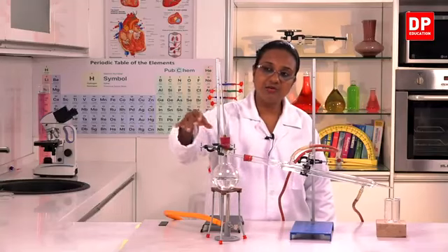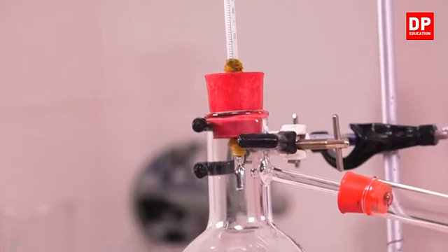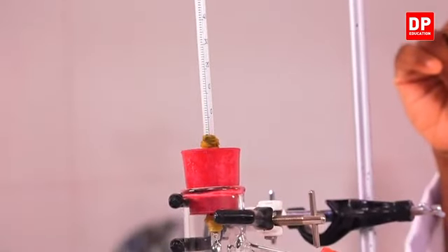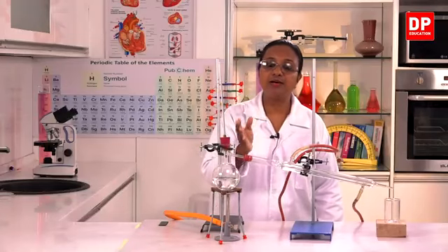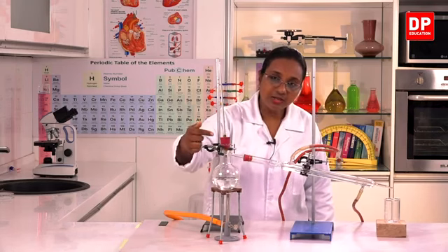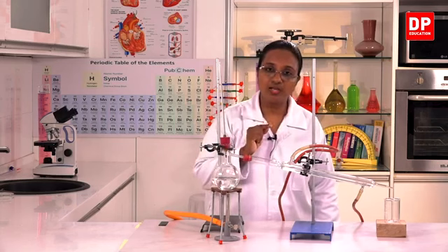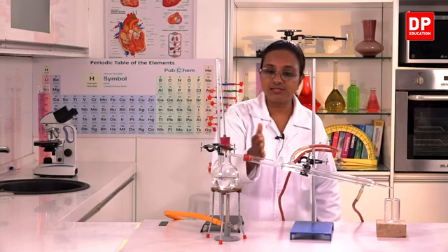At the same time, here you can see a stopper is attached to the round bottom flask so that the steam does not escape, and also there is a thermometer fixed to it so that we can observe the temperature of steam to make sure that only the water vapor is coming out of the distillation flask. And here you can observe the tip of the bulb of the thermometer is in line with the vapor outlet. So there you will be observing the temperature of vapor that is coming out.